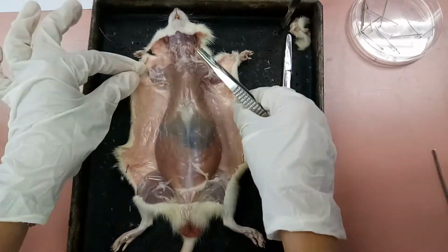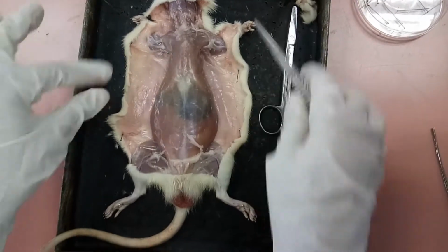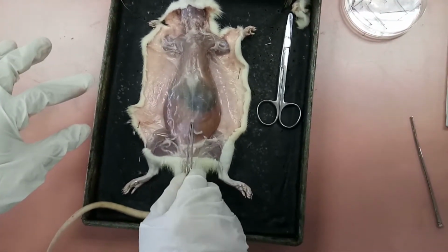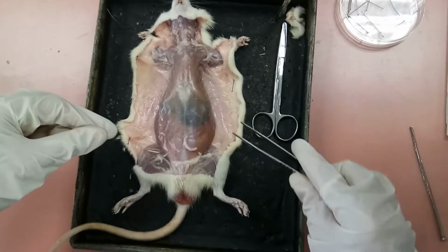Then we have removed all the skin, so we pin it aside. After this, we are going to cut the muscles to observe the internal organs of the rat.